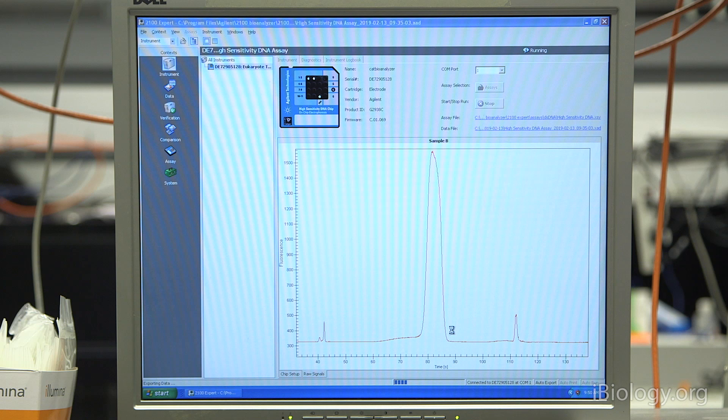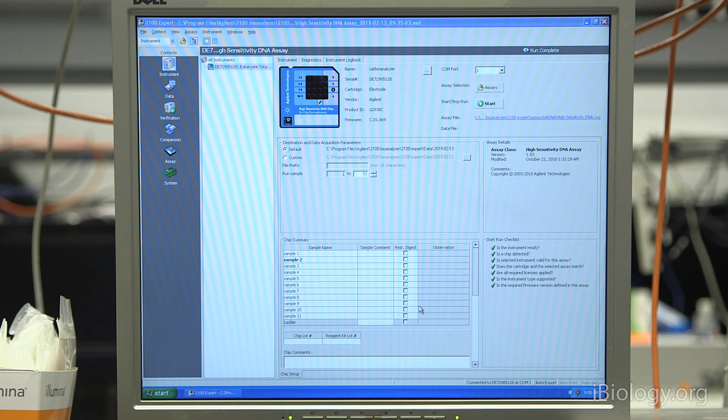Now the run is finishing, and I'll show you how to analyze and export the data. Now that that screen has disappeared, the run is done. To access our data, we come back over to the left-hand side and click on the data icon.